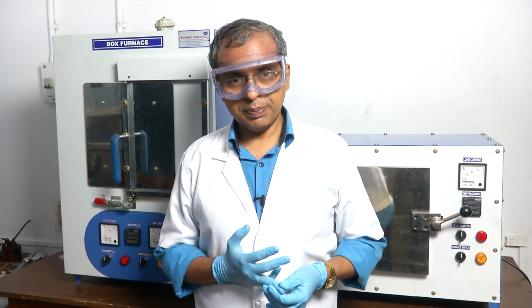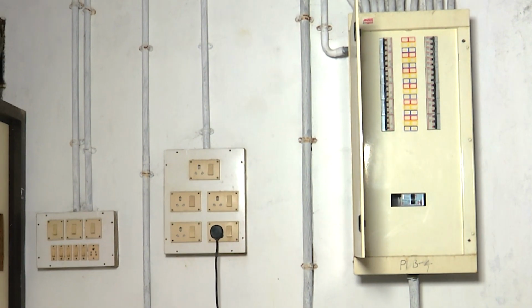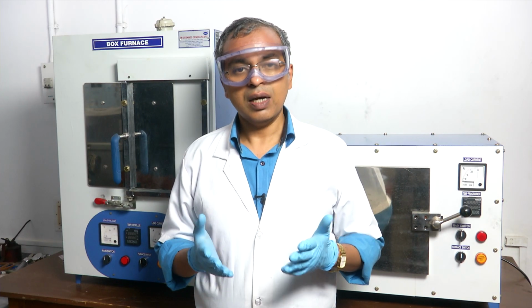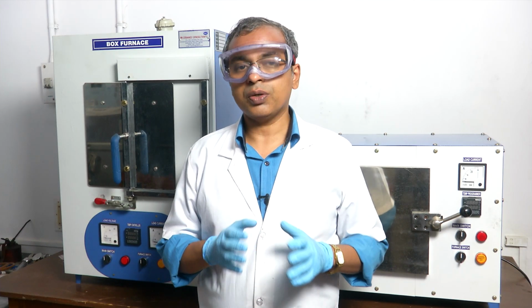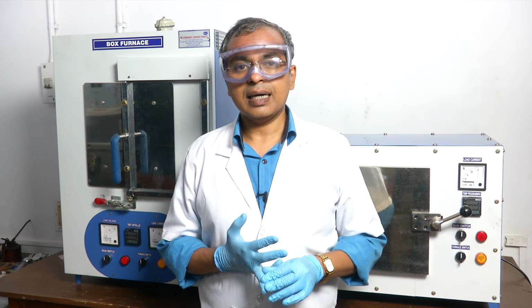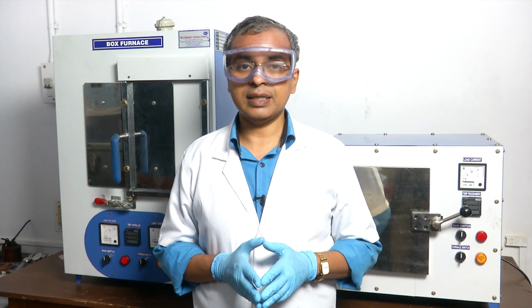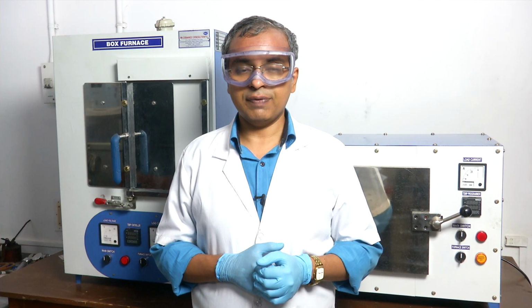The other thing that is commonly present in a lab is electricity. Any lab you go to, at least to power the basic infrastructure that is there in the lab, which could be lights, fans, some kind of a temperature control system, whatever it is, or to even just power the equipment that you use for your experiment, you are going to need electricity. So, electricity is another thing that is commonly present in labs, and it is one of the things that we most often tend to take for granted, because it is something that we see on a daily basis, but still there are a great many things that we need to be aware of with respect to electricity to ensure that we handle it safely.